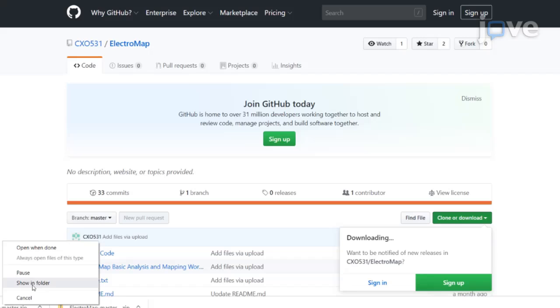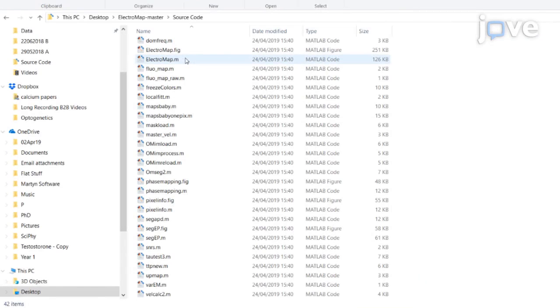Open MATLAB and navigate to the folder location hosting the ElectroMap source code. Then open the file electromap.m and press run in the editor to start the ElectroMap user interface.